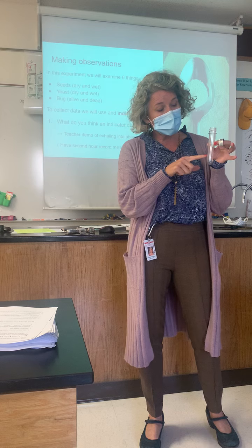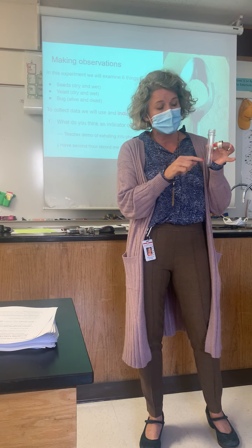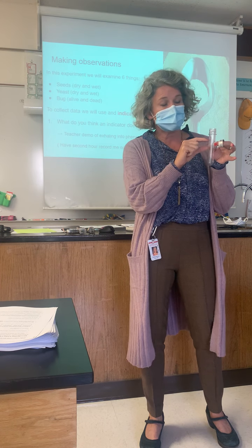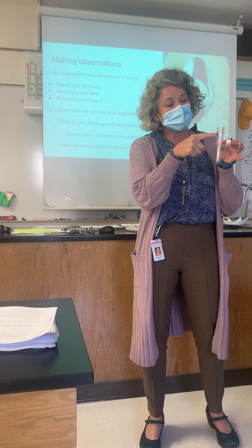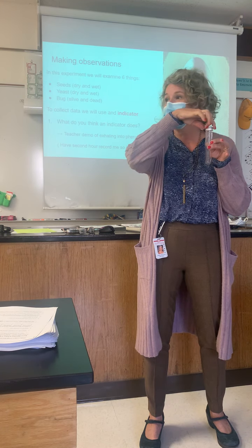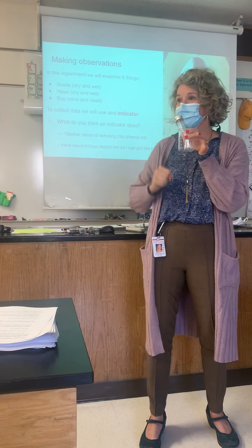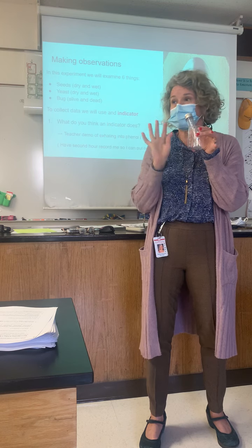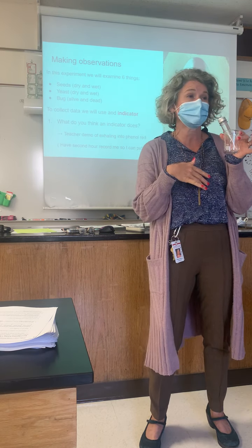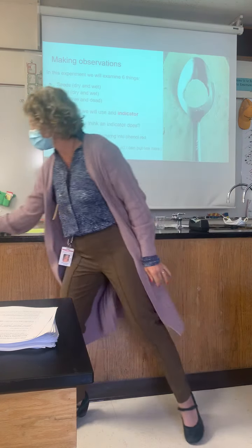So the phenol red will be on the bottom, that liquid indicator that I'm going to show you in a second. And then about 1 or 2 inches above that liquid will be that foam, suspending that organism above it. And then we're going to cap it, put it in our beaker, all right? And then we're going to let it sit for a couple days to see what happens. And we'll come back to it next week, and we'll be able to figure out maybe some things from it.